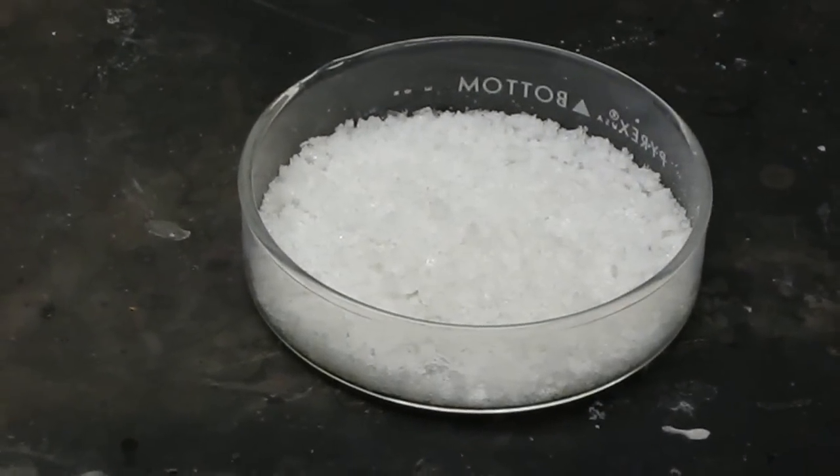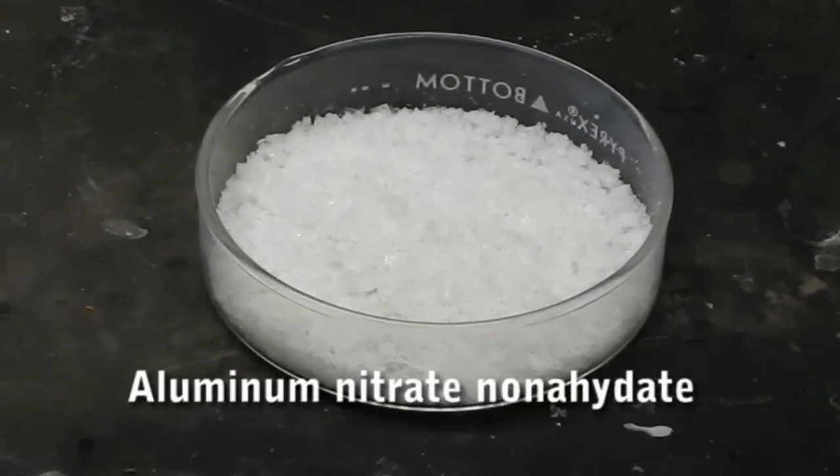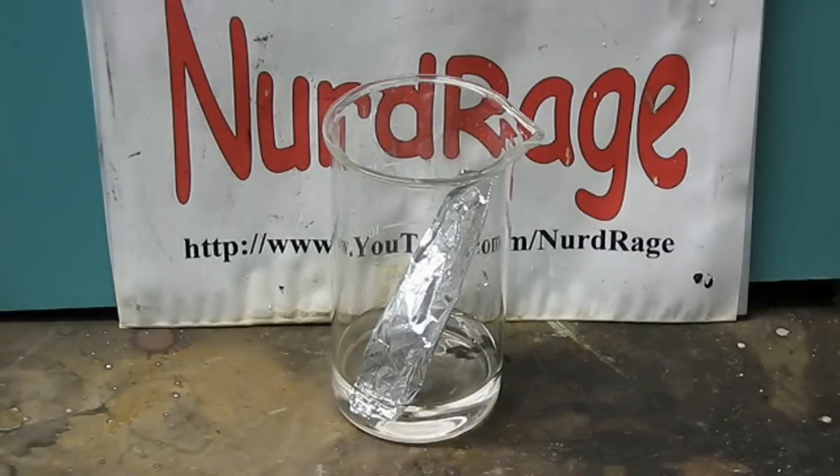Greetings fellow nerds. In this video we're going to make crude aluminum nitrate nonahydrate that we'll need in upcoming videos. At first you might think that we can just add aluminum directly to nitric acid. Unfortunately, as seen here, aluminum does not react with nitric acid due to a passivation layer that forms on the surface. We need to go through a roundabout method to get to aluminum nitrate.